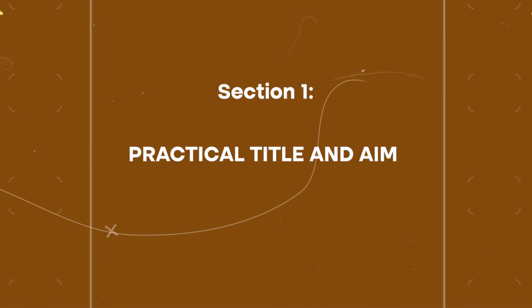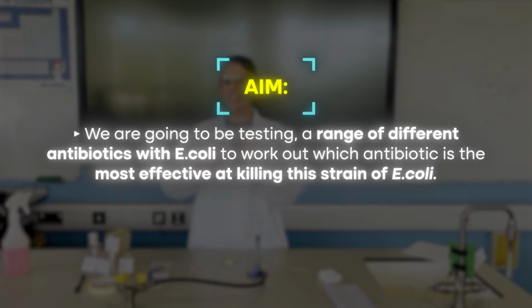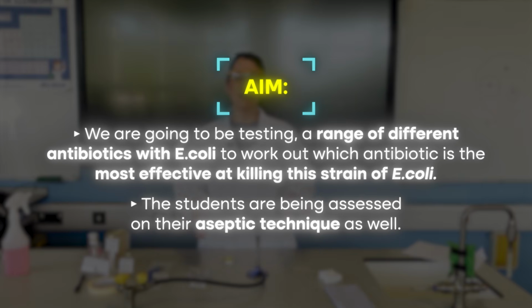So in this experiment, we are going to be testing a range of different antibiotics with E. coli to work out which antibiotic is the most effective at killing this strain of E. coli. And within that, the students are being assessed on their aseptic technique as well.